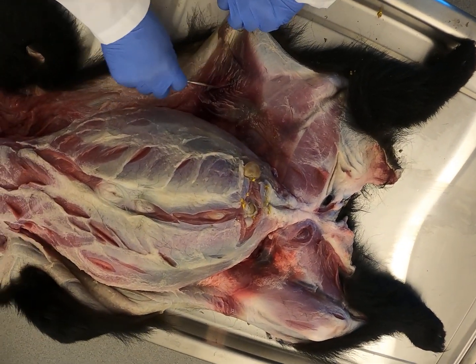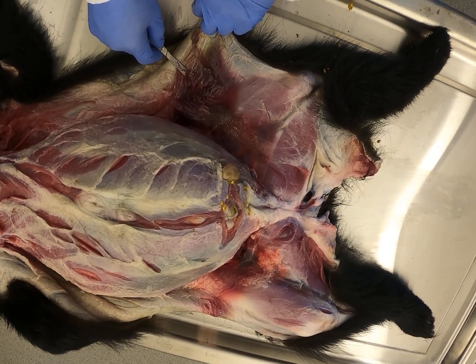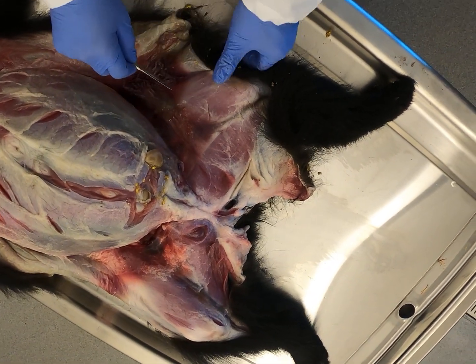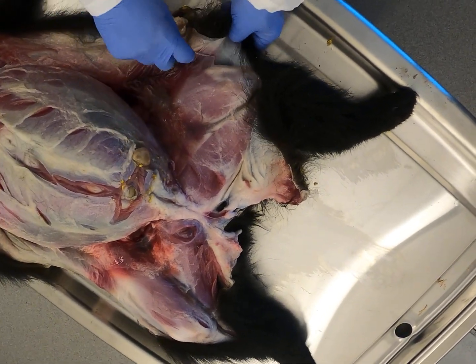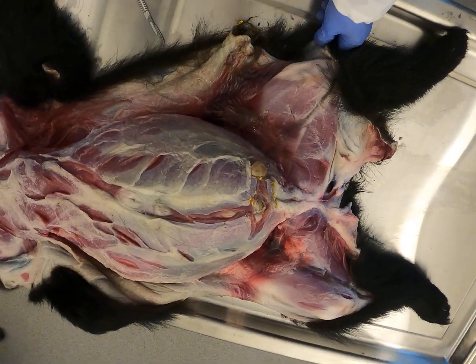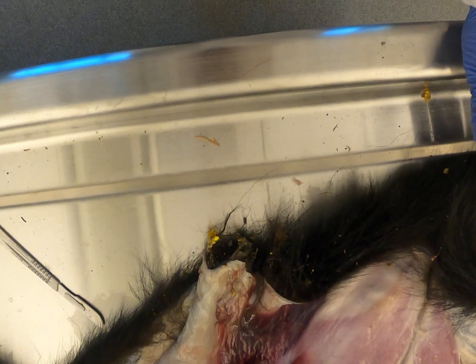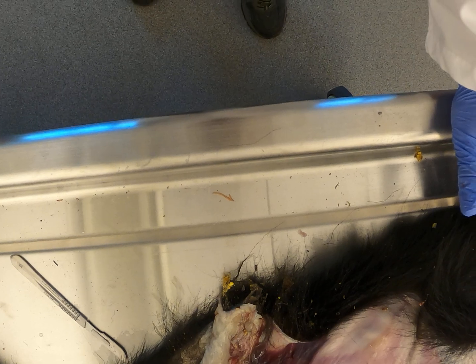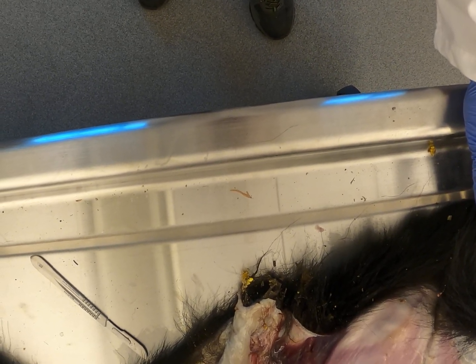Now we're getting some good evidence of this trauma — all of this damaged, bruised tissue inside the hind leg and the groin. Hopefully you're able to see that well. I'm going to turn this video off so I can roll the animal and we'll expose the other side of the thighs in a minute.